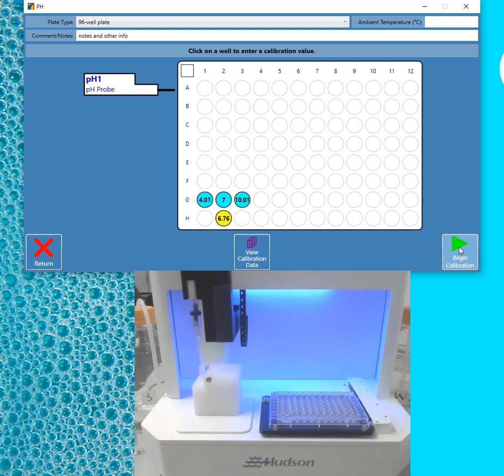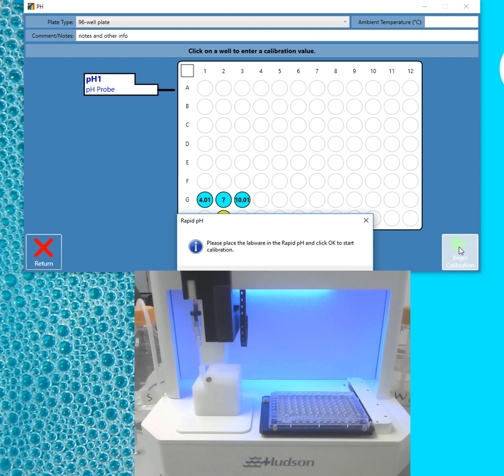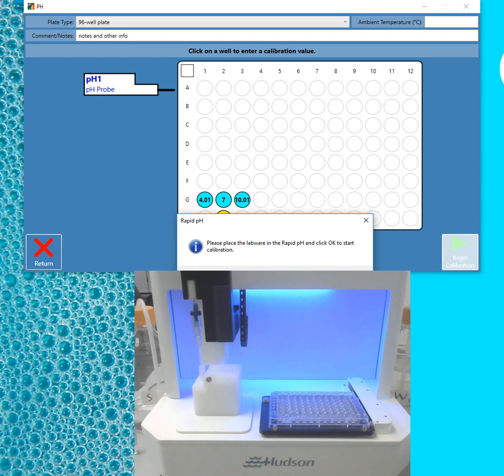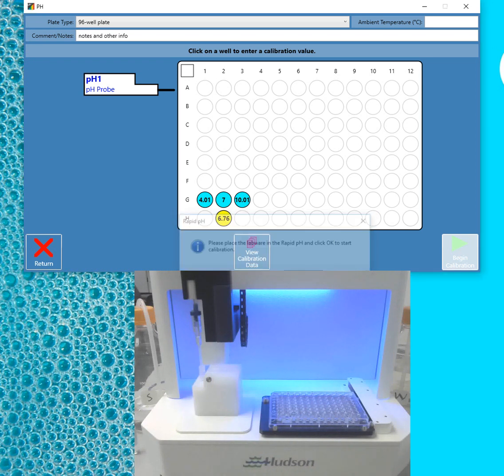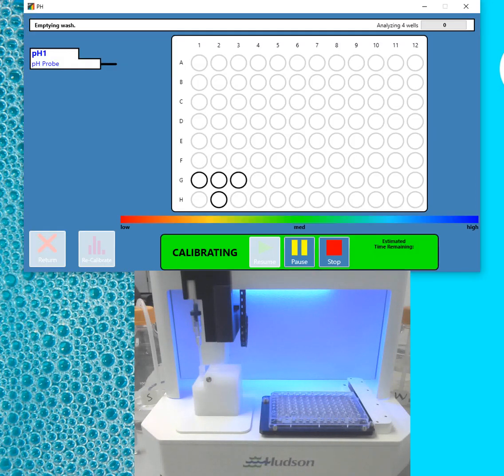To get started, just click Begin Calibration. You get a quick pop-up that says, please place the labware on the Rapid pH and click OK. And now it starts running.